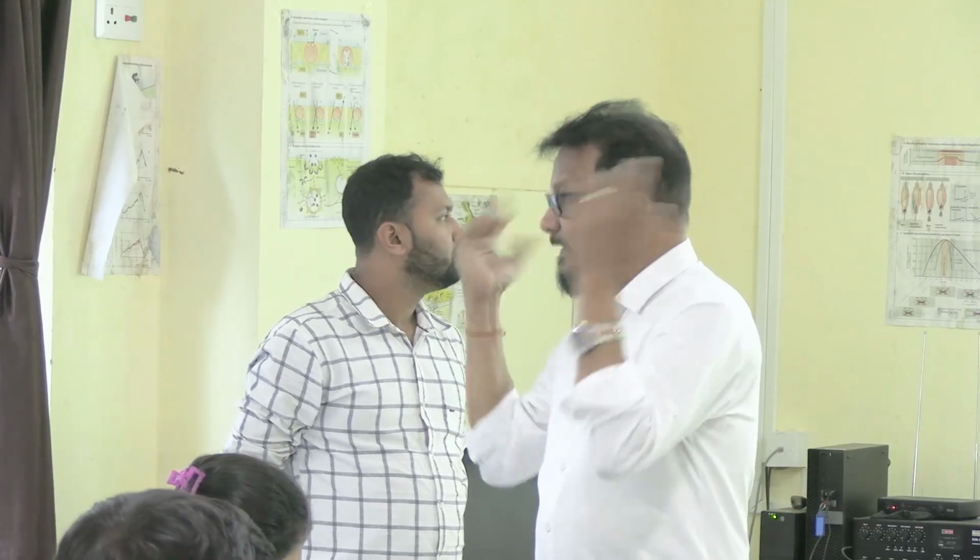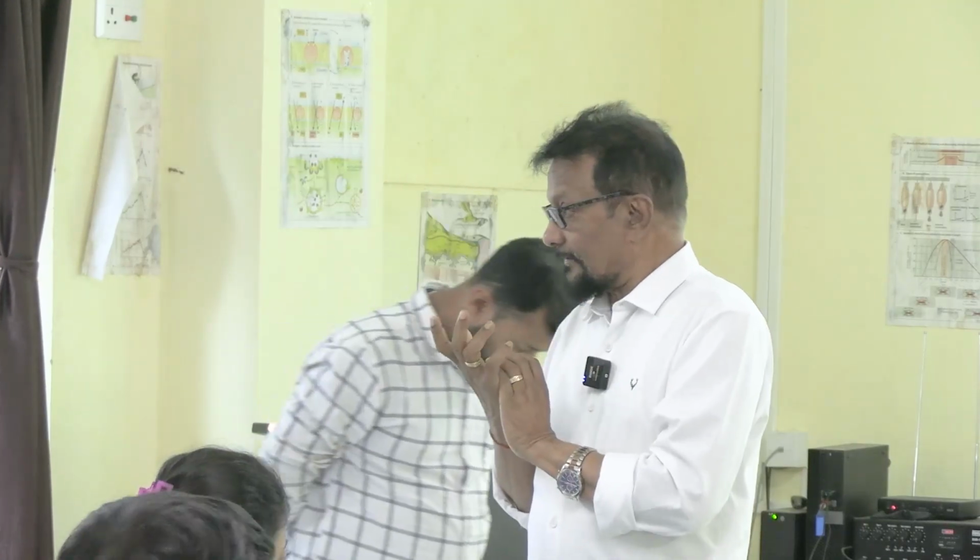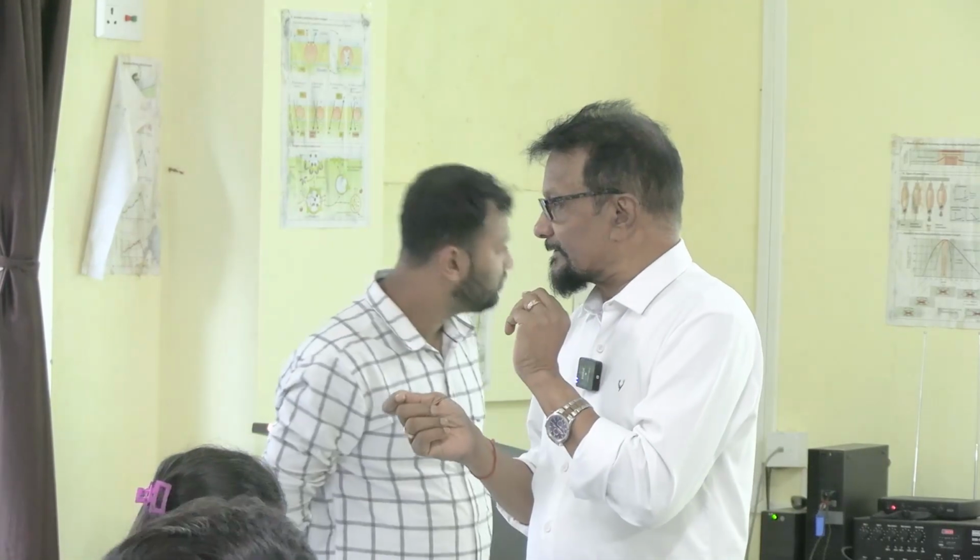Okay, so how many things do you require? One is the nerve muscle preparation. Second is the setup for stimulation. Another is the setup for recording. And the fourth one is the setup for estimating the time, measuring the time of different time periods. And that can be done by using a tuning fork.